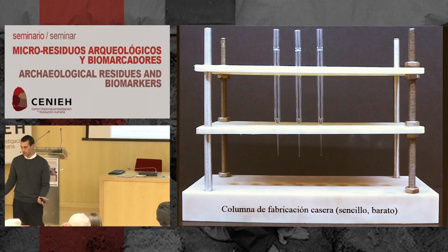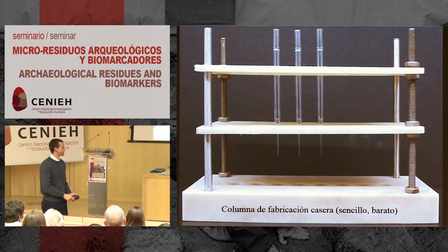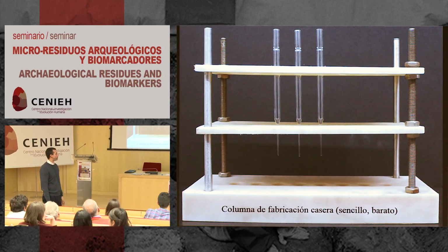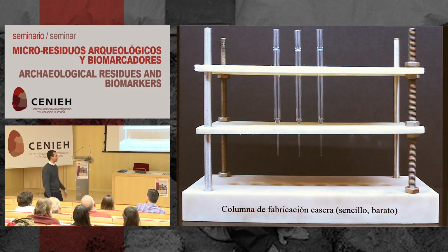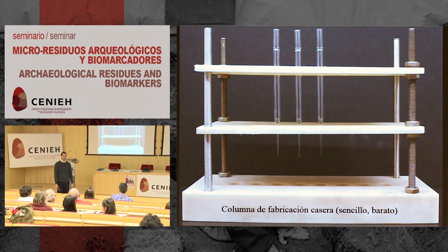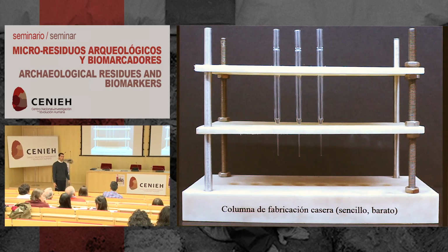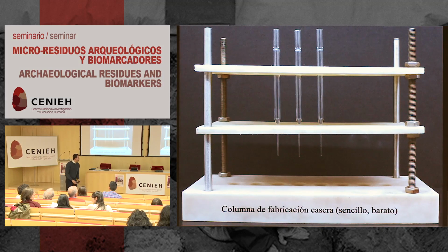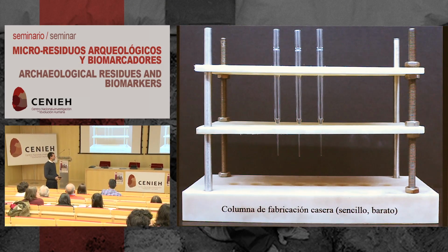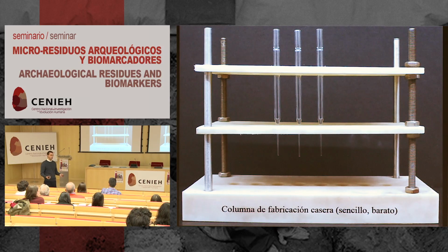So again, this is just for sample sake. You can do them one at a time and use a pipette holder or whatever, but this was a contraption that was made by a university in China when we did it, and this fits up to 8 or 9 samples at a time, so you can really fly through in a day as many samples as you need to. These are empty, obviously, but really simple, just pieces of plastic and screw bits, and you can just make it whatever you want.